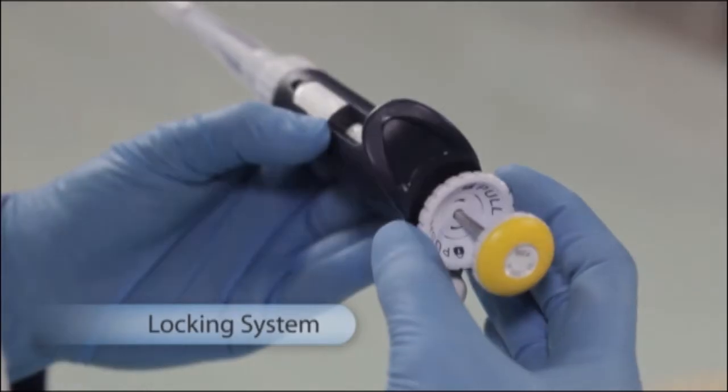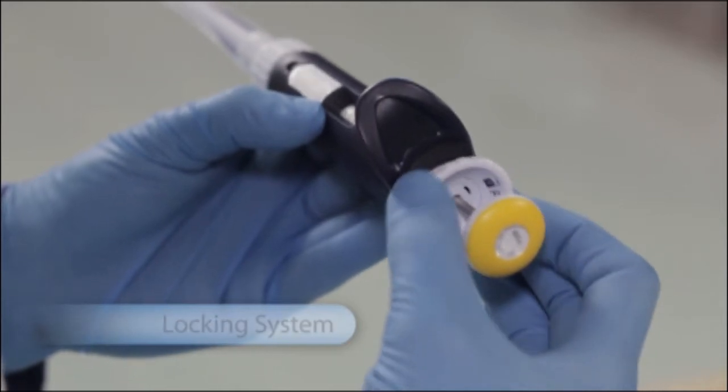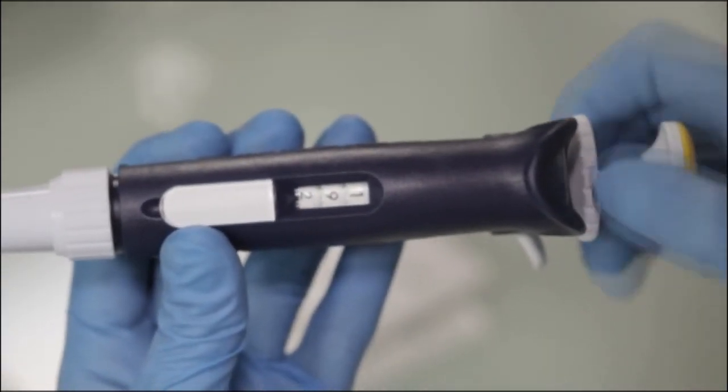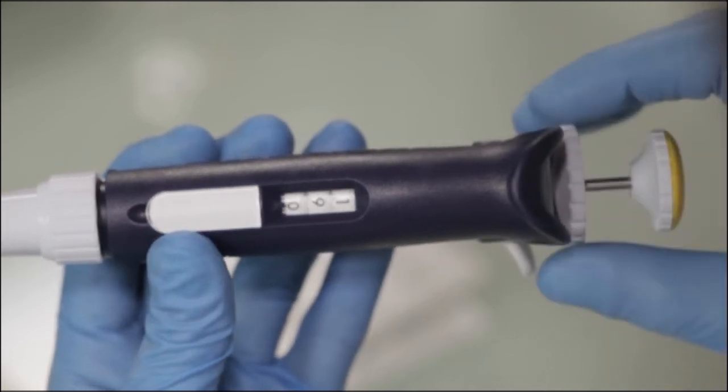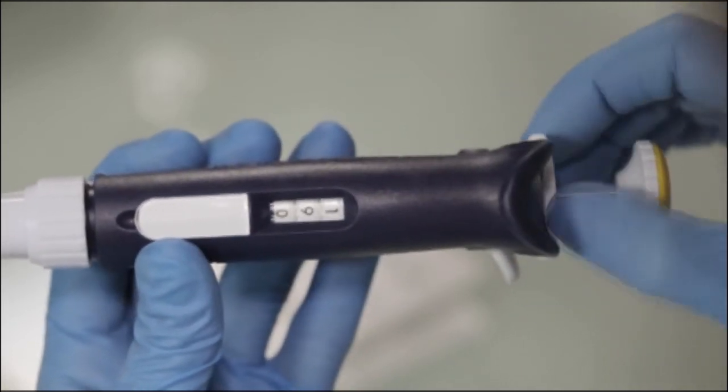A lockable volume system guarantees secure pipetting. It is easy. Just push the thumb wheel up, rotate it to change the volume, and push the thumb wheel down to lock it.